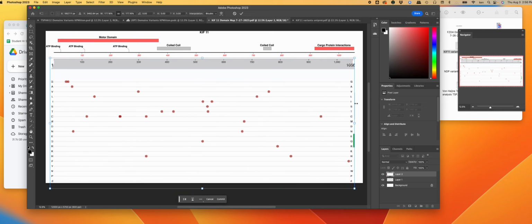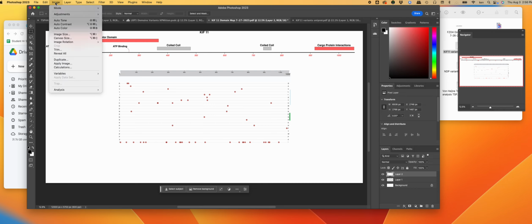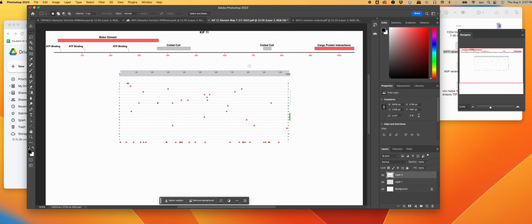If I think I need more canvas size, I'm going to cancel that and actually add more canvas size now, because I need a little bit more. So let's maybe make 150% more. Stretching it down. Okay, let's try resizing this again. Going to do a save of what we have in the intermediate here. I'm going to save it on my computer too, so I'm just down in a different dialog box saving this on my computer.